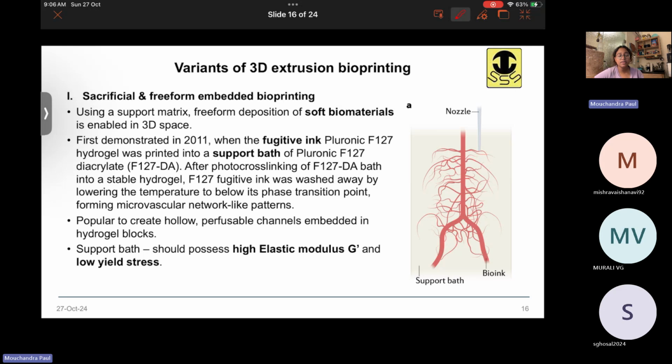So there are 8 types. They are the most widely used. Definitely you're correct. It depends on what type of tissue you want to bioprint and also the resources that you have. Let's say you have access to decellularized ECM, because it is ethically very difficult to get, and commercially, if it is available, it will be very expensive. So first you have to check what type of tissue you want to bioprint, what type of cells you are going to work with, and whether or not those cells grow very well in the type of bioink material that you're thinking of.